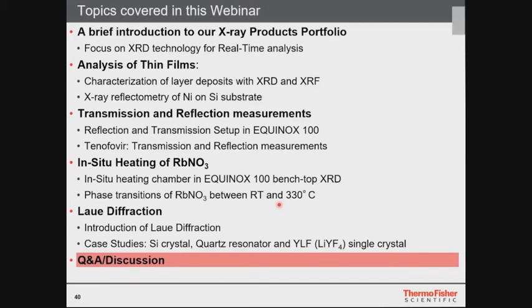Our measurement range is, depending on the instrument, limited to something like maybe 0.5 degrees 2 theta. So if it's sufficient to measure, let's say, 0.5 degrees 2 theta and upwards, then there is something we can offer. If it's necessary to measure below that, then we don't have a solution at the moment. We don't have SAXS instruments.